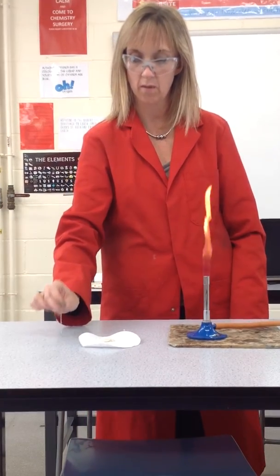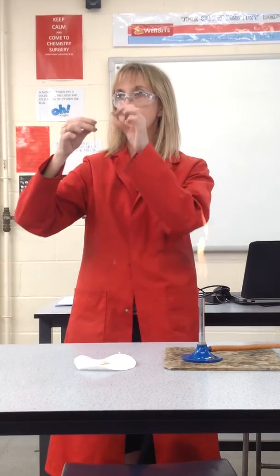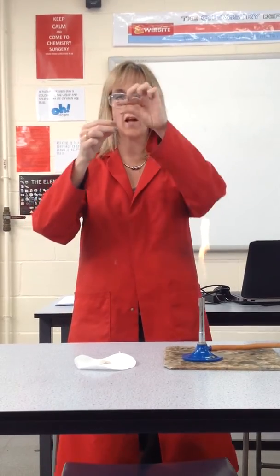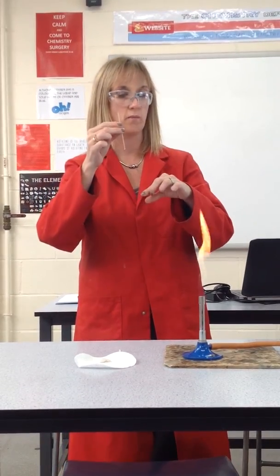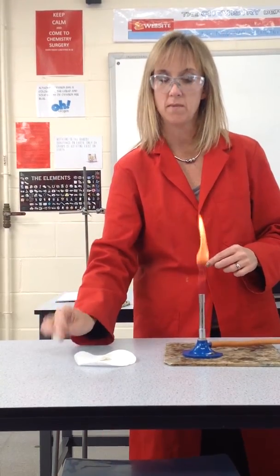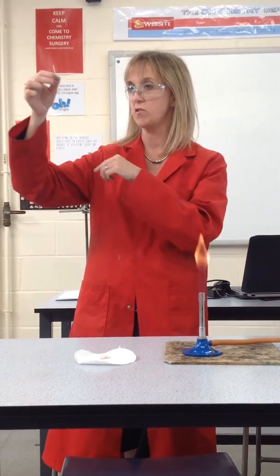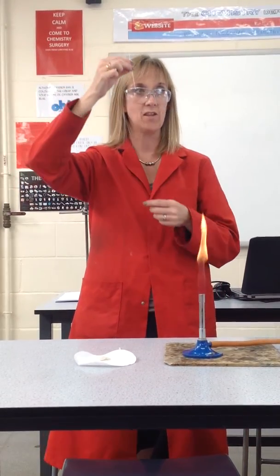Turn it up the other way and tap it repeatedly to get your crystals to go down to the bottom. Don't try and put too much in at a time, otherwise they'll all get clogged up at the top and won't go to the bottom. Do a little bit at a time, tapping between each addition. You're aiming to get about one centimetre depth of crystals in the bottom — you need to be able to see them clearly.